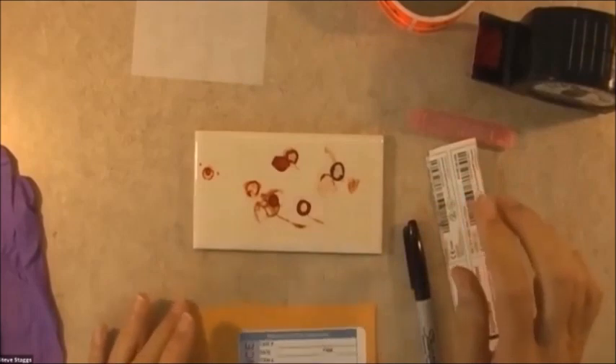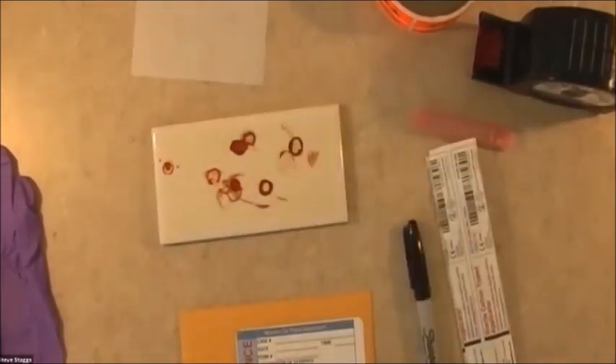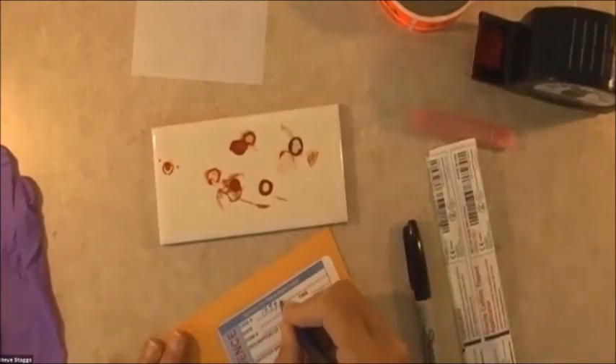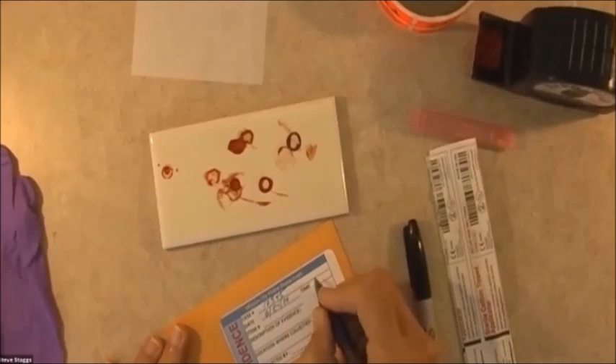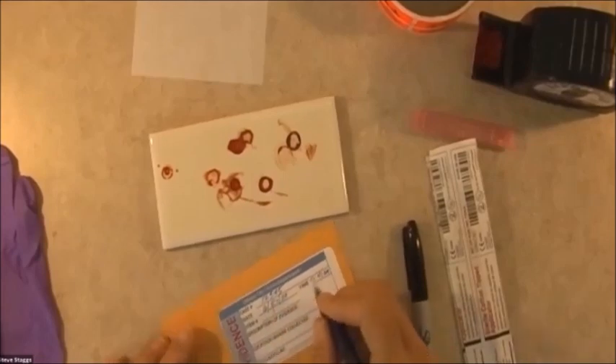We're going to go ahead and get our packaging ready before we put on our gloves. So let's say this is our first item. I'm going to go ahead and put a case number on here, and the date, and the time. And this is item number one. Description.